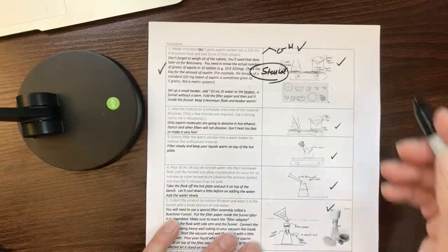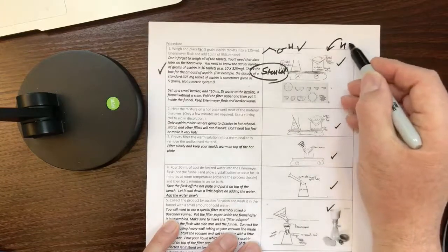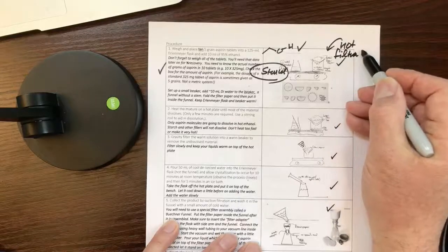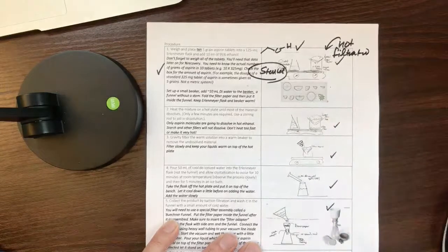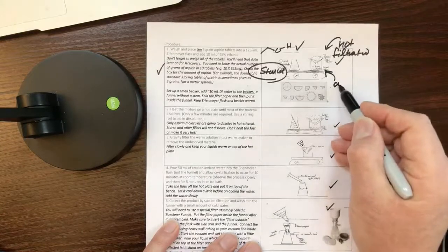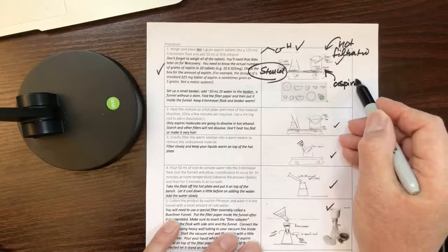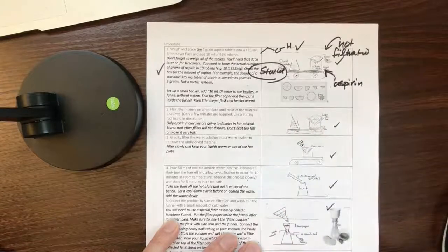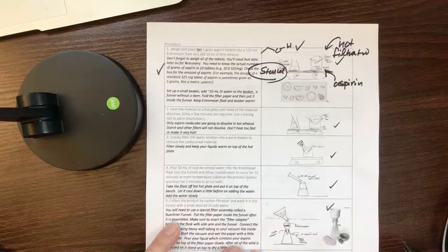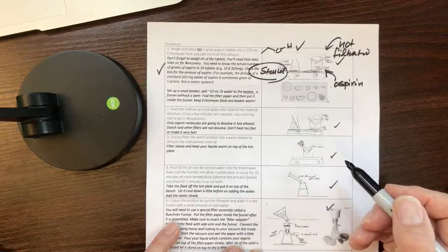We're doing a hot filtration. Hot filtration helps us to remove the starch from the aspirin, so the aspirin stays in the liquid. Then we're adding water to it to make it solid.